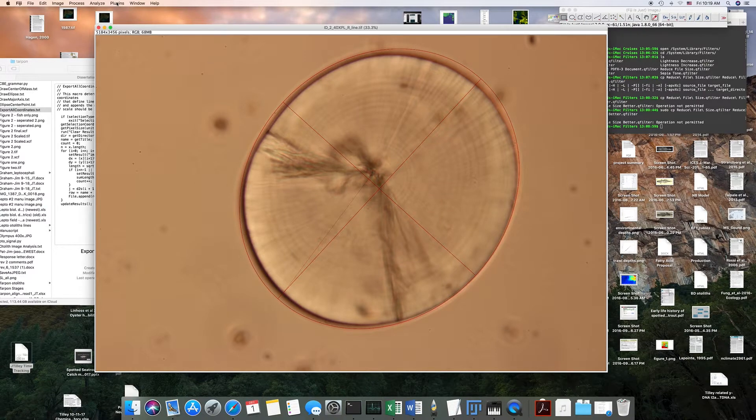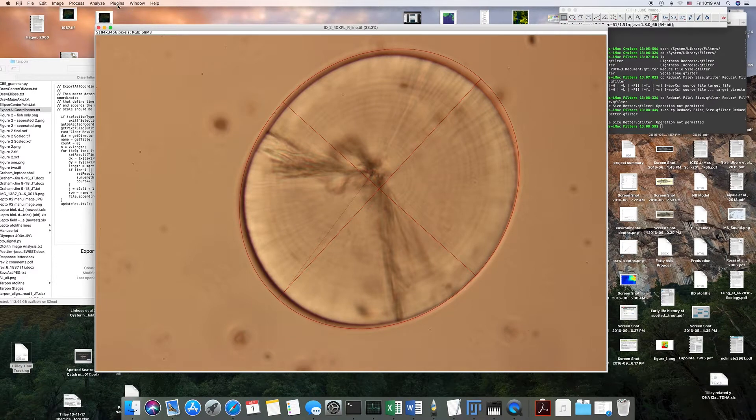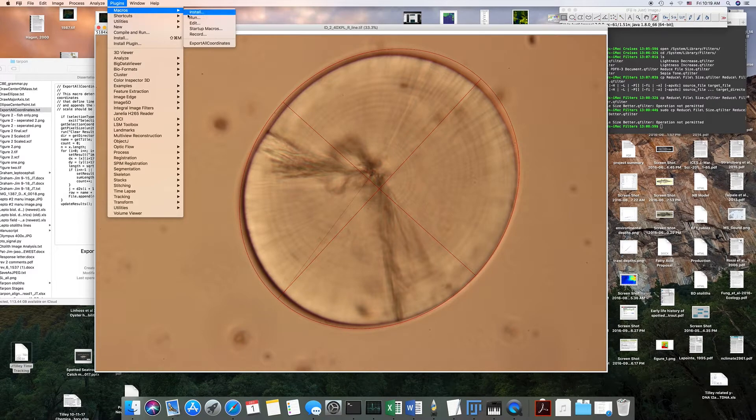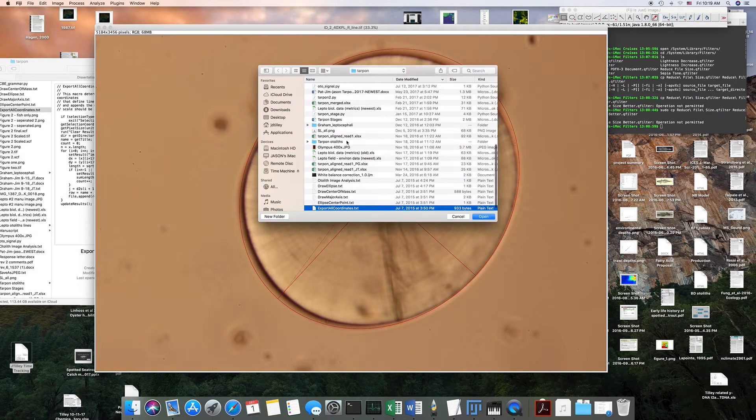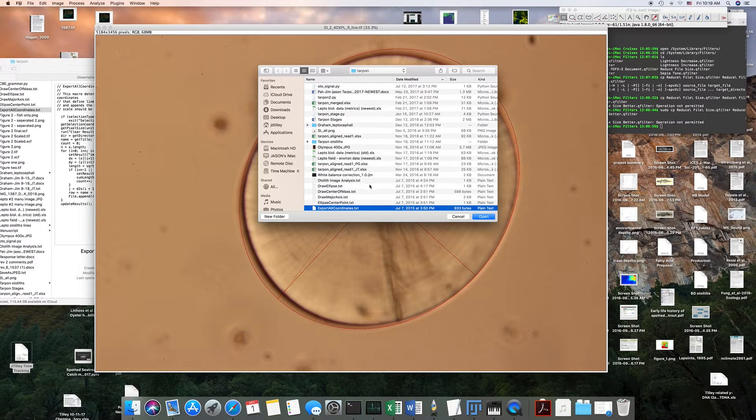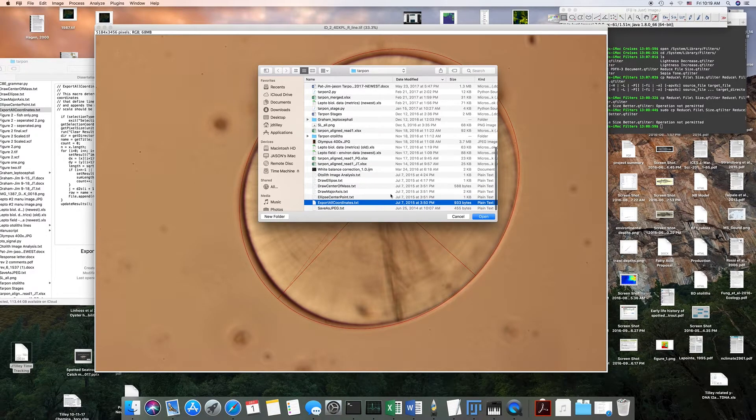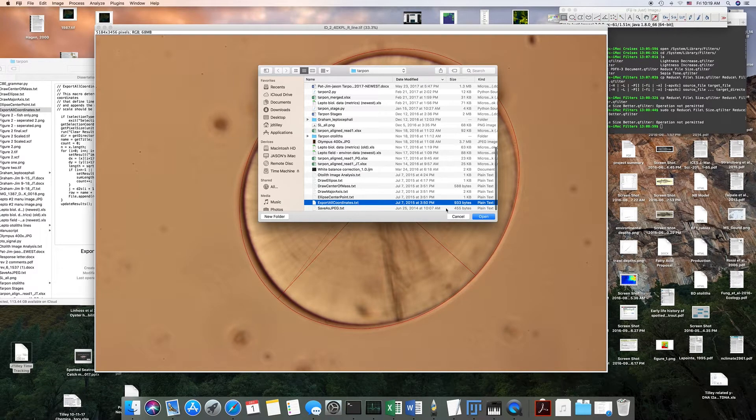So you will go to plugins, then go to macros, and click install. You'll go to whatever folder you have the macro in, and it's called export all coordinates.